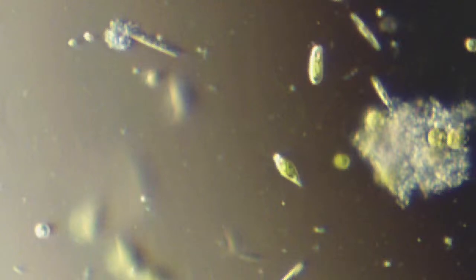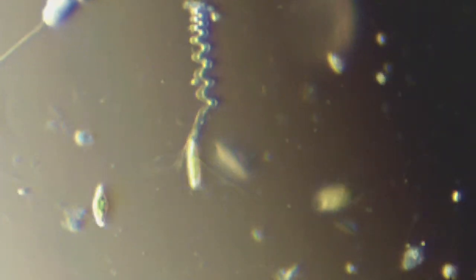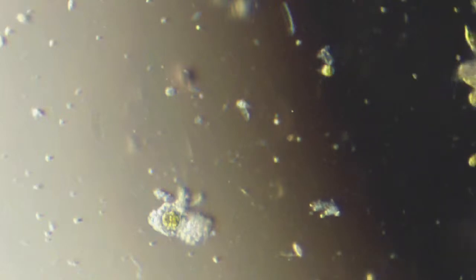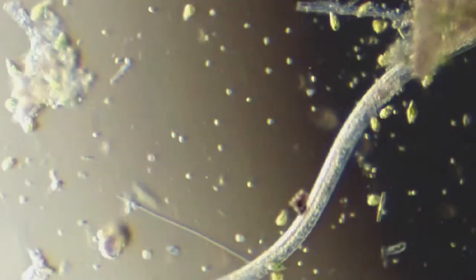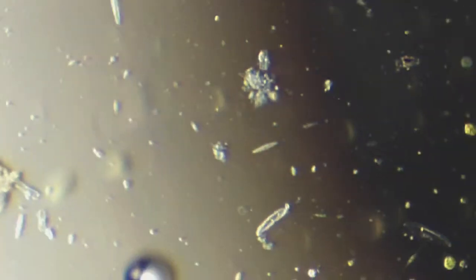What else we got here? There's that field I was in before with all these guys. There's an interesting structure there. Look at that squiggly thing. Haven't seen one of those before either. There's nematode again. There's another nematode going crazy. Zoom out a tad because I'm a little too close. Nematode just banging up all those poor Euglena. More diatom shells everywhere.